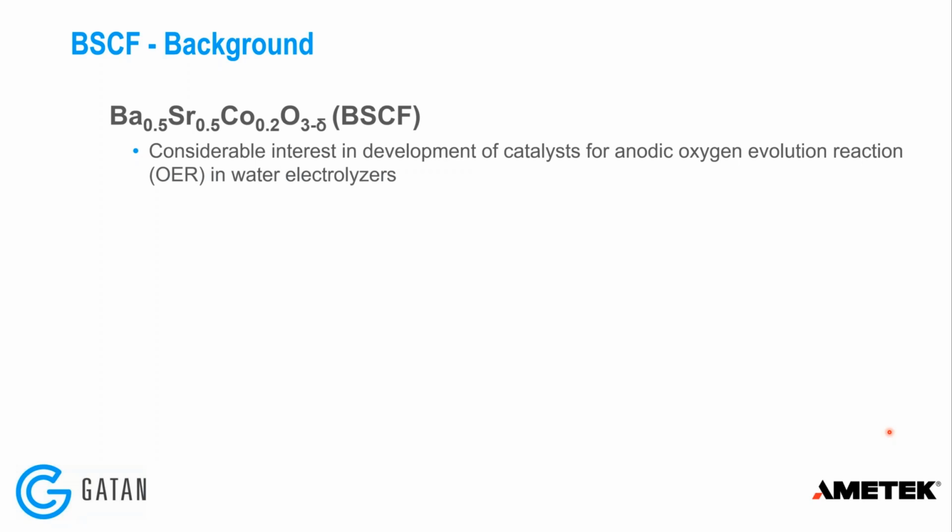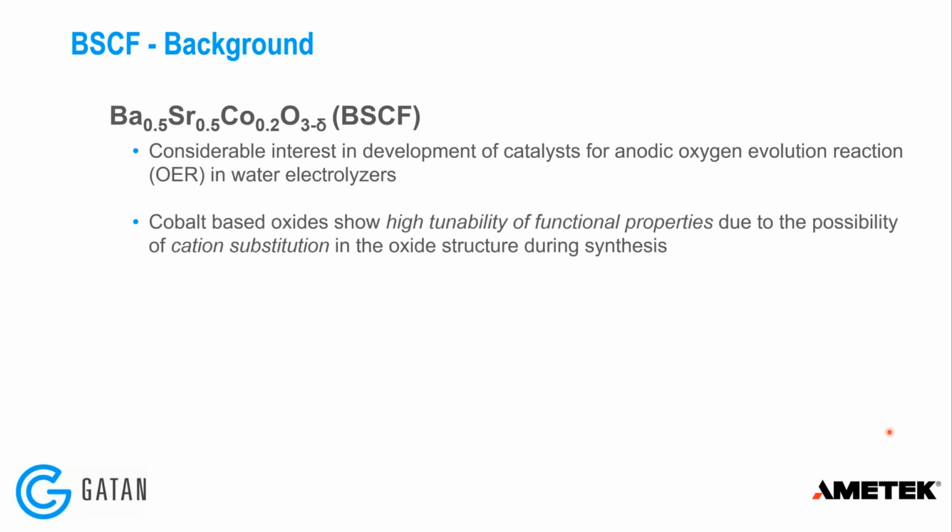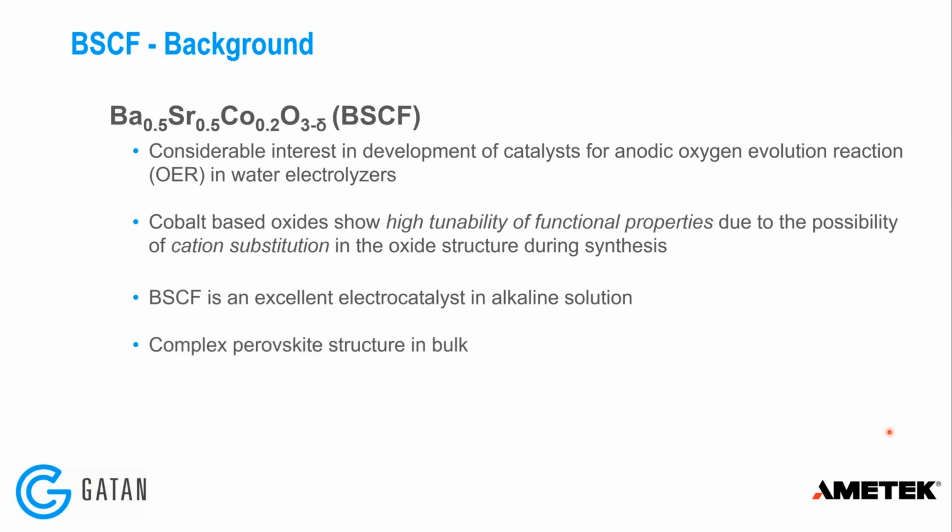So there's considerable interest in development of catalysts for the anodic oxygen evolution reaction in water electrolyzers. Cobalt-based oxides in particular show high tunability of their functional properties due to the possibility of cation substitution in the oxide during synthesis. So BSCF is a really good electrocatalyst in alkaline solution.